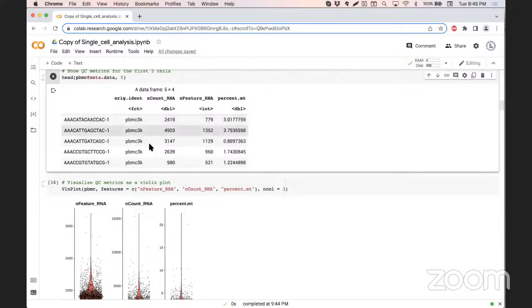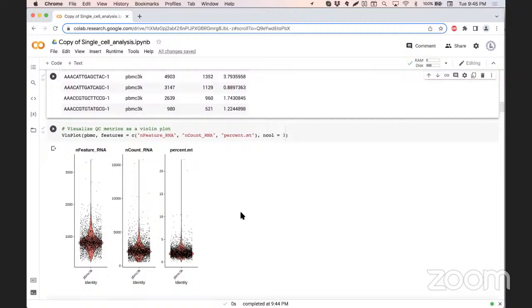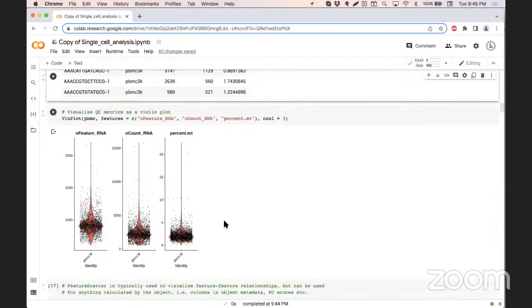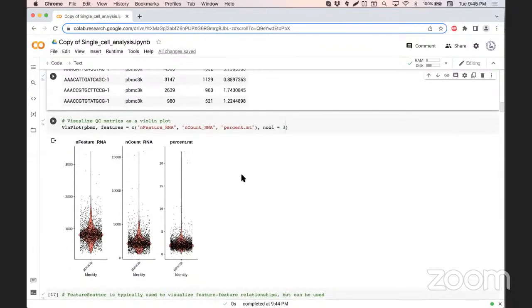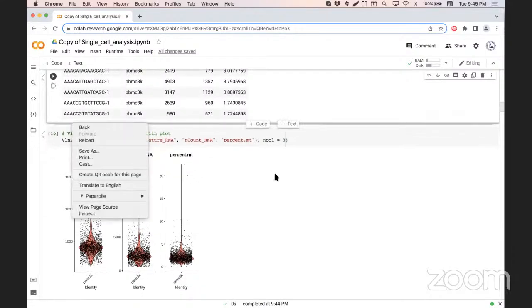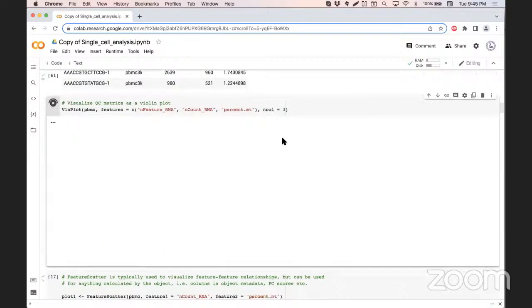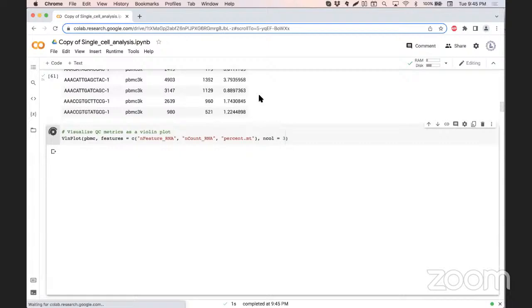So this is the input file that we will use for our violin plot, which will tell you the percentage of mitochondrial genes for the samples, or the unique UMIs for the samples, how many different ones we have, and then we can set our threshold based on this. So when we plot the violin plot, we will know what we want to plot here. Then we can use this to identify it.